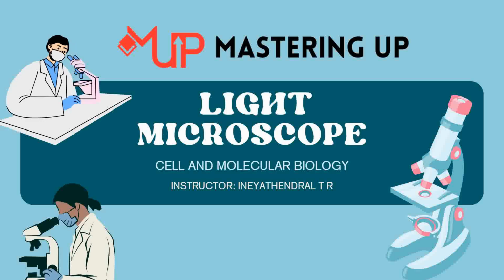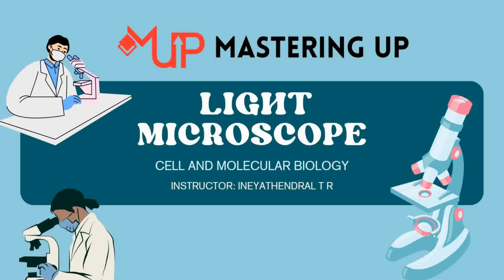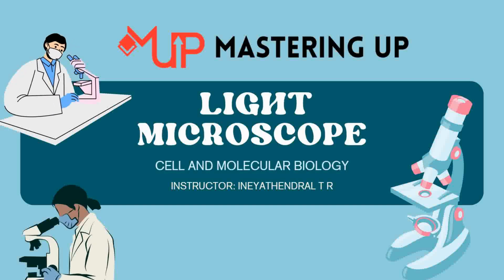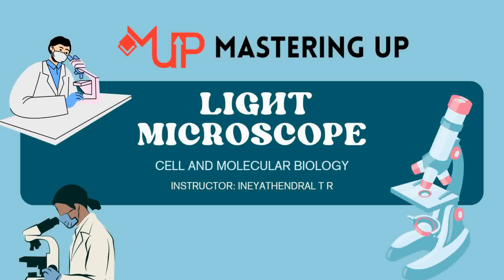Welcome back to the Cell and Molecular Biology course. As we have discussed earlier, the most important invention that led to the modern understanding of life at the cellular level is the invention of the microscope. In this video, we will explore the light microscope in detail. Let's begin.